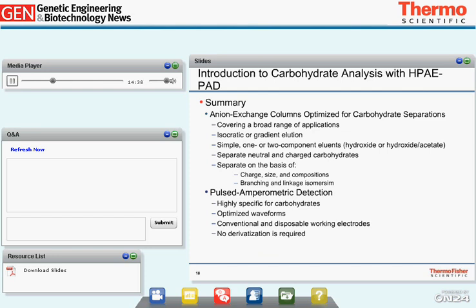The pulsed amperometric detection, or PAD, uses optimized waveforms developed for gold electrodes, and they enable highly specific detection of carbohydrates without any derivatization. This slide concludes the first part of today's webinar. And now back to you, John.